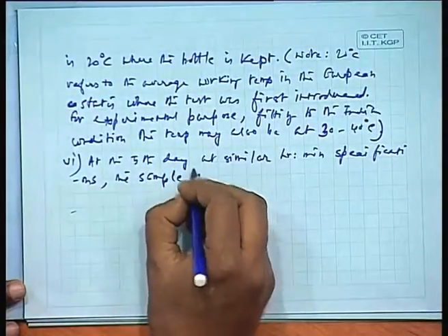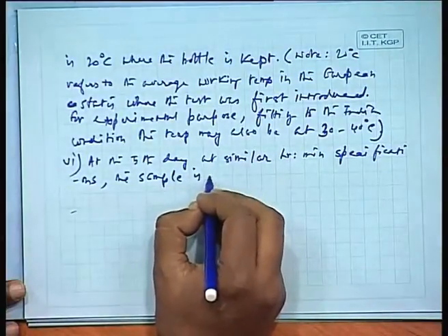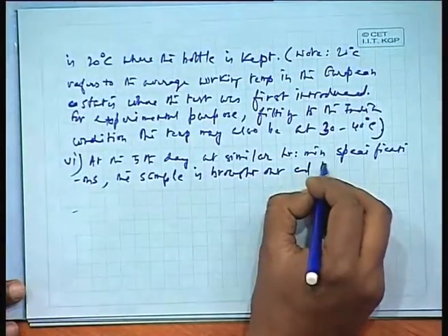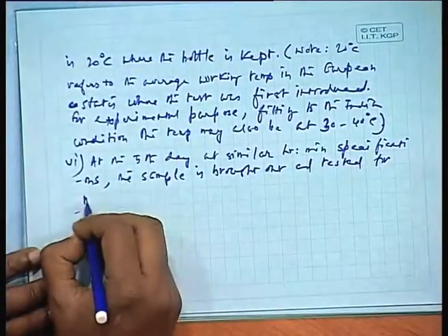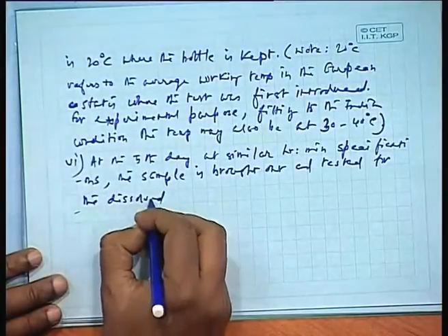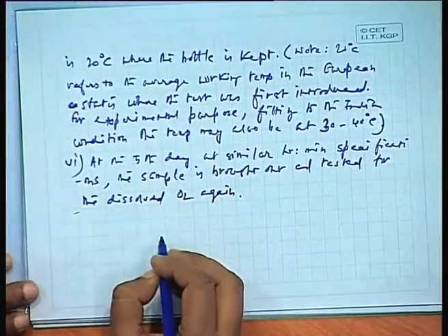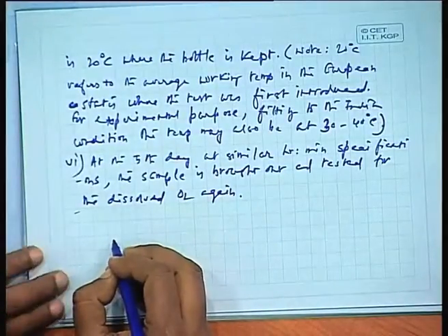the sample is brought out and tested for the dissolved oxygen again.